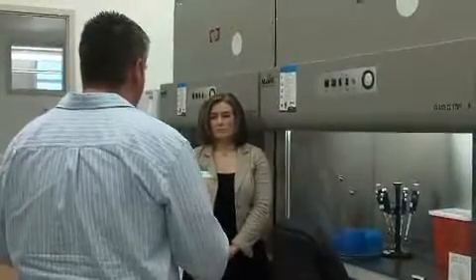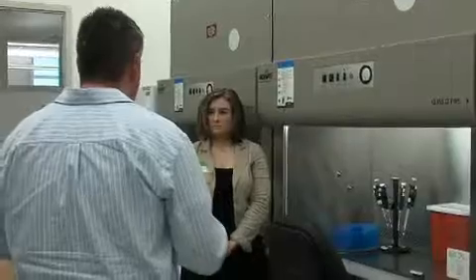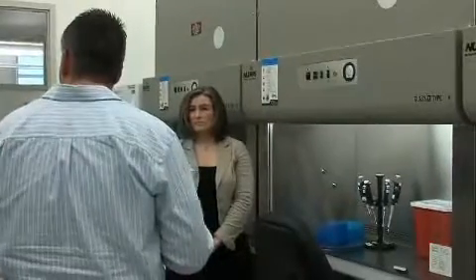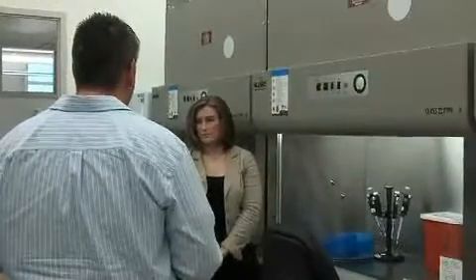This is essentially a clean room for us. Once the DNA comes in here, we mix it with the reagents that are actually going to allow the PCR process to happen. Once they're mixed with those reagents, then they're put into the pass-throughs, which you see on the wall to the left here, to my left. Now what happens is we put them in the pass-throughs, and then the analyst can leave this room and go into the next room and actually retrieve it from those pass-throughs.